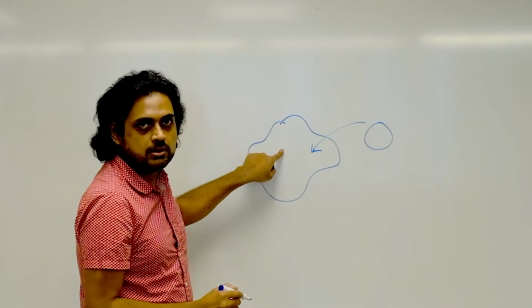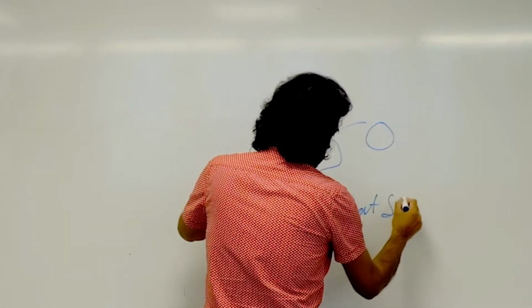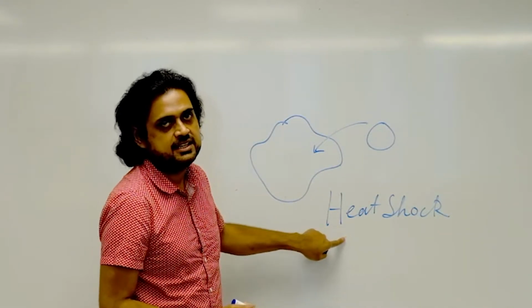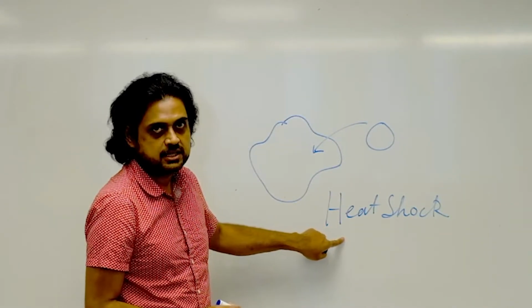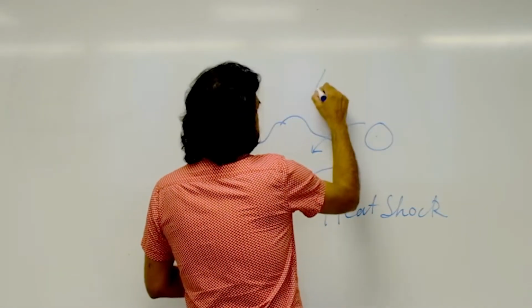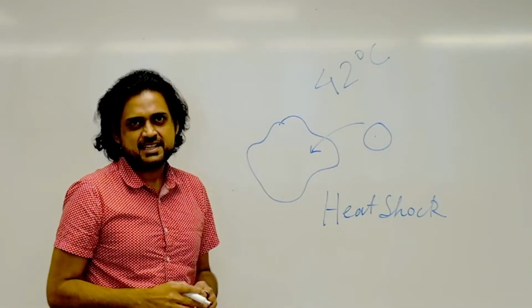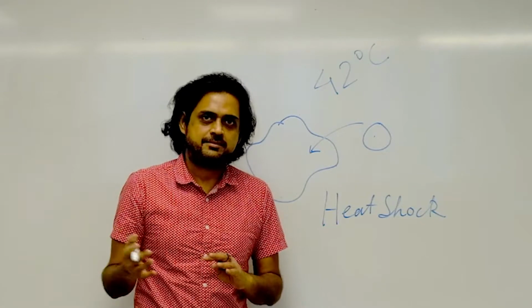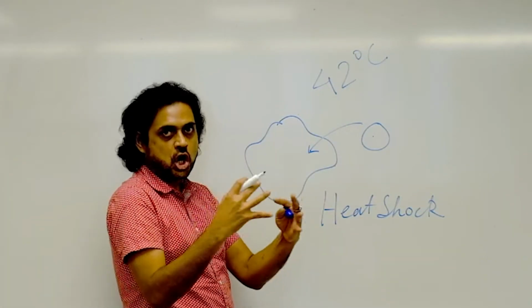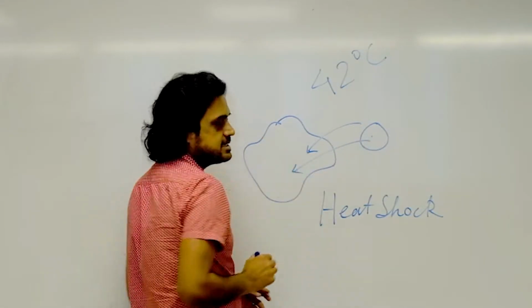So you take these E. coli cells and go through a process of heat shock transformation. This heat shock transformation is a very simple method of transformation where you take your cells, you take the DNA, and you incubate them at 42 degrees centigrade for about 45 seconds. Different labs do it for different times. We do 45 seconds in the lab. Then what happens in this shock, we call it heat shock, the plasmid DNA will enter the cells.